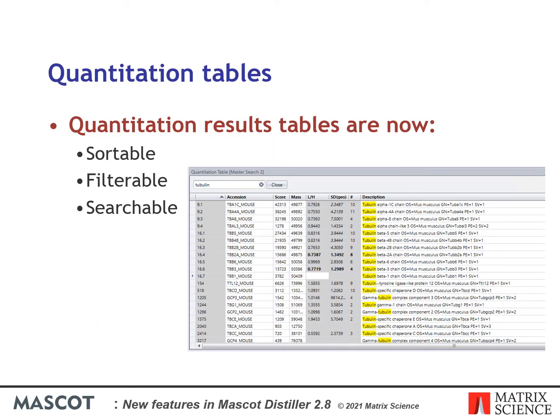There are some new features available on the protein and peptide quantitation tables. Tables are now sortable either by clicking on the column header or from the column context menu, and they are also searchable and filterable. Here I've enabled the table search panel and searched for tubulin on the protein quantitation results table. The table has been filtered so that only the matching protein rows are displayed, with the matching text highlighted in yellow.